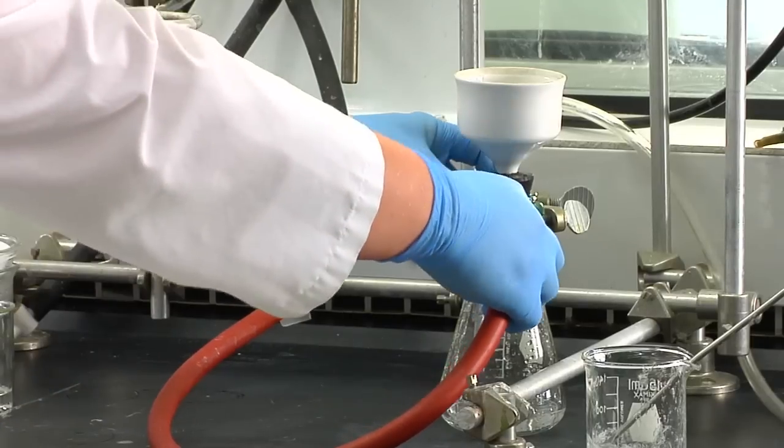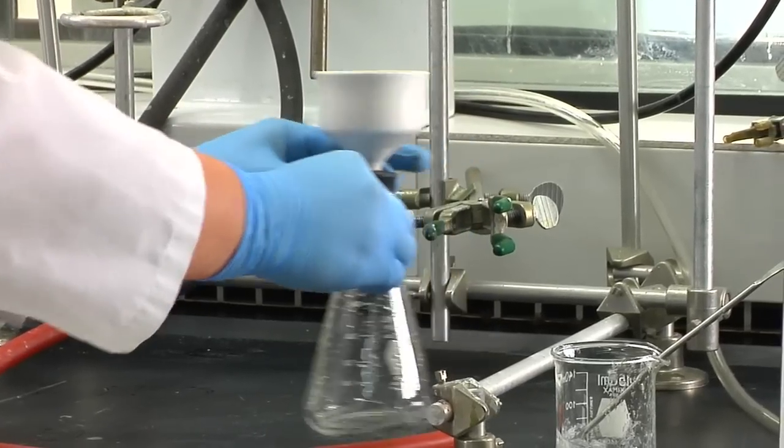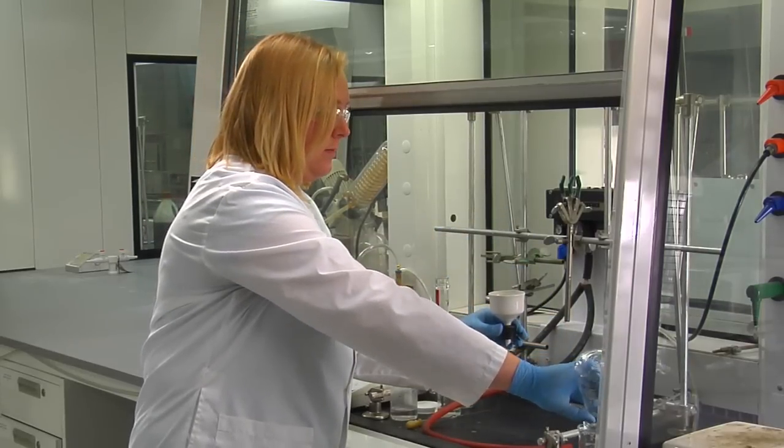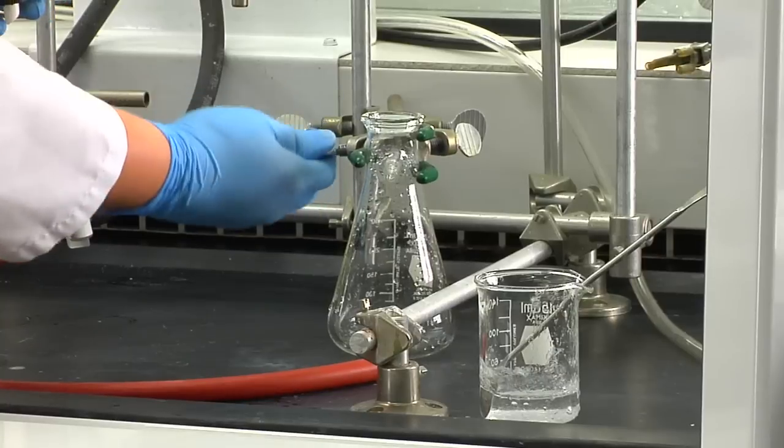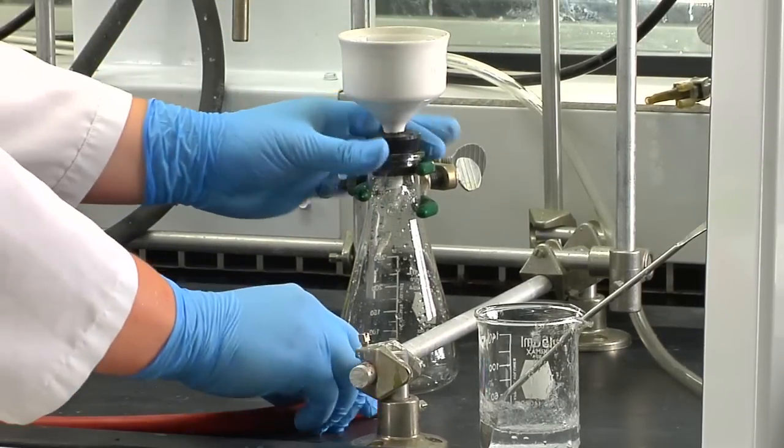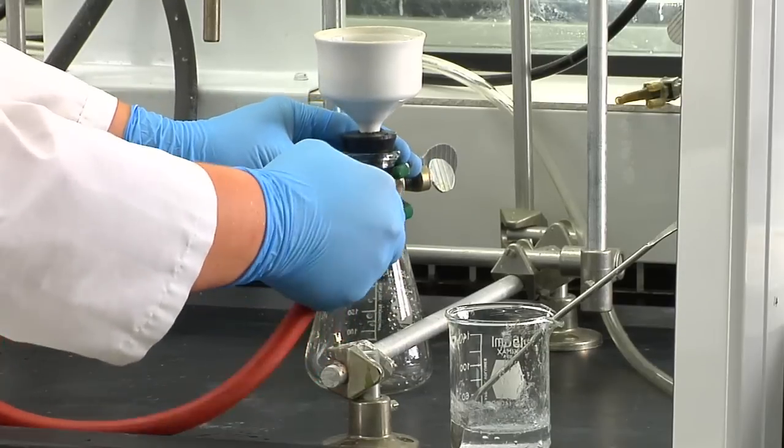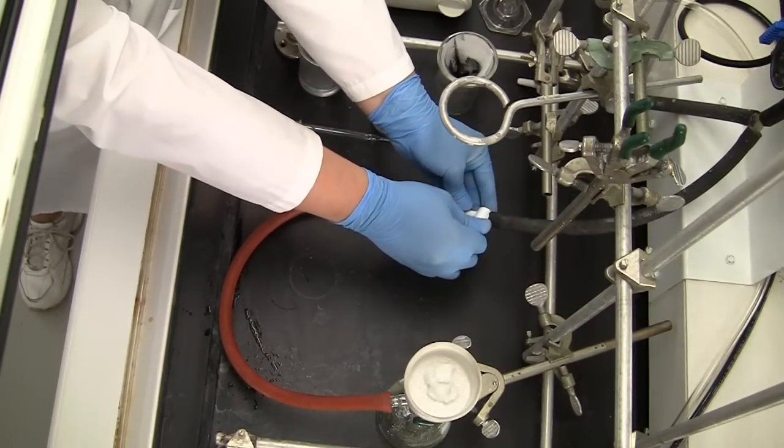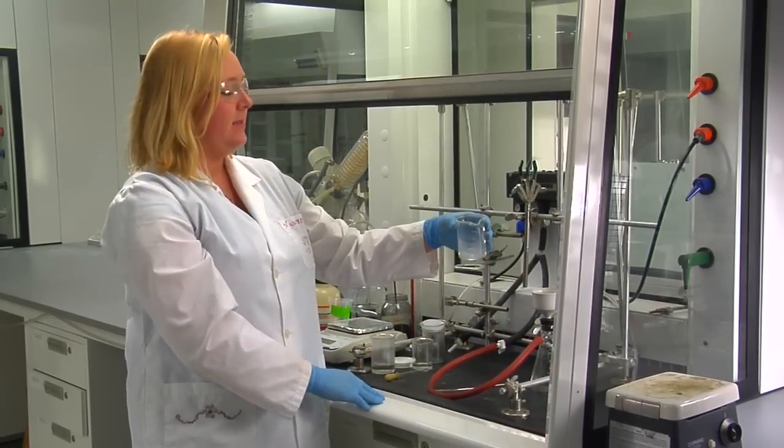To do this, just remove the hose from the filter flask, unclamp it, and pour this liquid into your beaker. And set this apparatus up again. You'll apply the suction again. Turn the stopcock. Then you can rinse out any remaining salicylic acid.